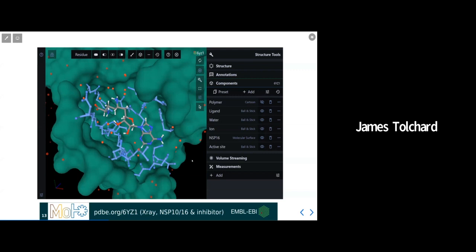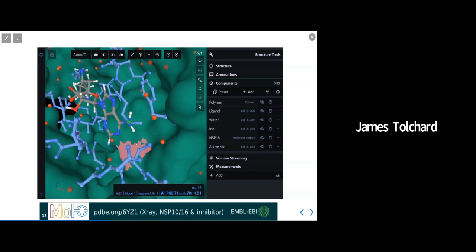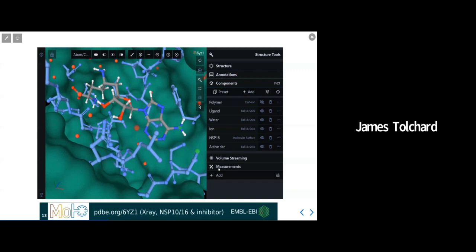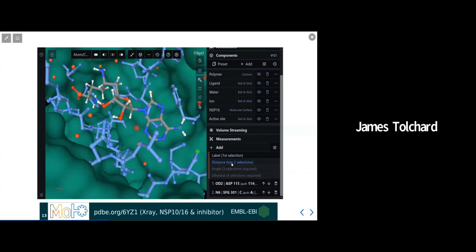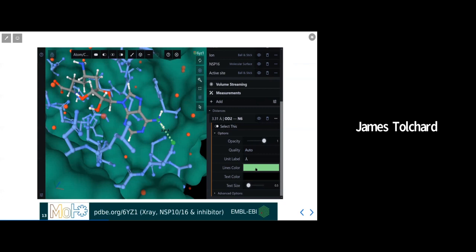At this stage, I might also want to pick out some interatomic distances to highlight. To do that between atoms, I should use the atom level granularity. I simply need to choose two atoms. So if we pick two, for example, at the nucleoside end of sinefungin. Once any two atoms are selected, you can simply choose add from the measurement section and then to create a new distance. All measurements are defined in this way, and you can choose to change the color and style of the line, or indeed the text, as you would for representations in the components above.